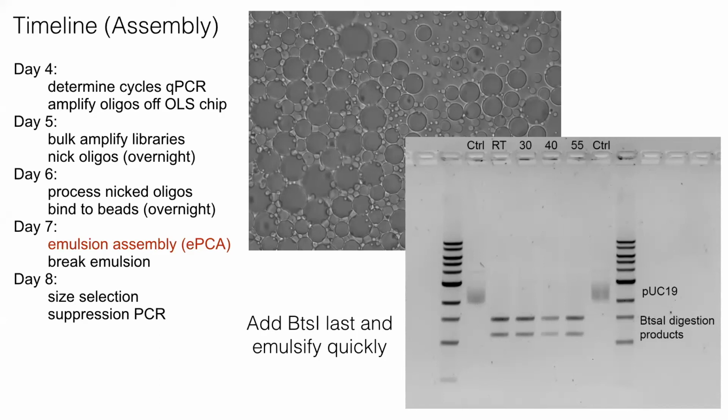And so I want to mention several things here. One is that the beads in the vortex method are highly polydispersed. It doesn't matter, don't worry about it. The bigger problem is if you, as we tried to initially do, try to use microfluidics to get a very monodispersed level of beads, that the BtsαI type 2 supposedly temperature-sensitive restriction enzyme that we use to cleave the payloads off the surface of the bead is actually still really active even at room temperature.